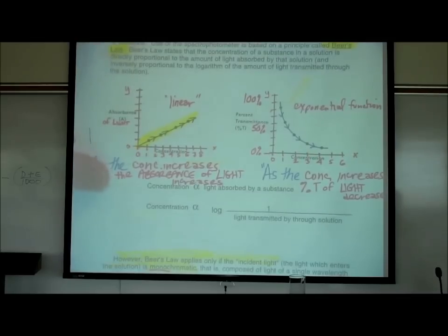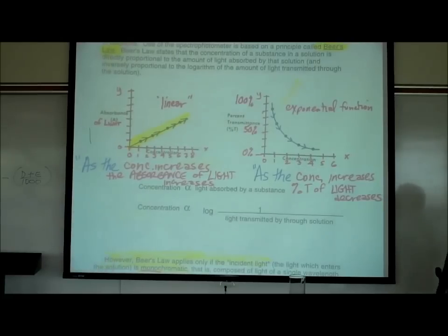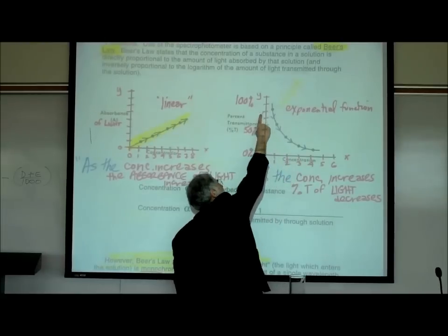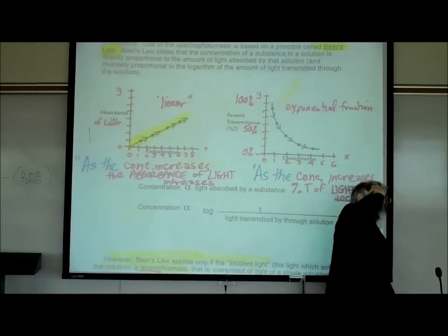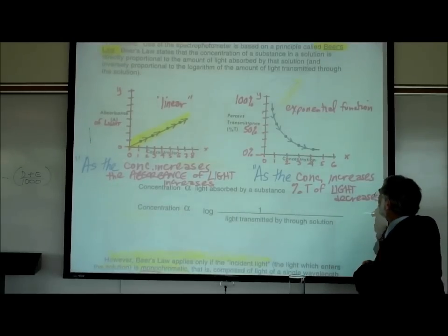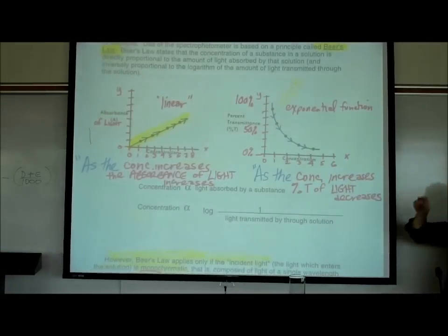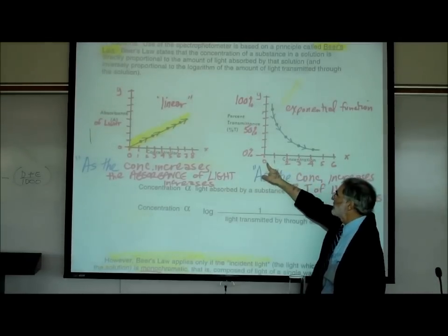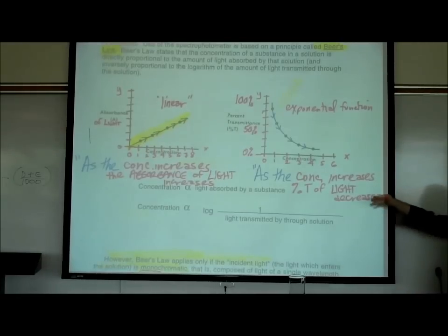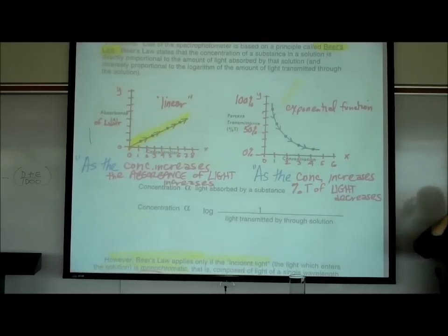We have already told you by the time you're done with this physiology class, you're going to be very good at reading graphs. All right, let's start with this graph. This graph, we always begin first by looking at what's plotted on the x and y axes. So what's plotted on the x-axis is the concentration of the chemical in the solution. Now, I made up numbers 0, 1, 2, 3, 4, 5, 6. That's simply showing increasing concentration of a chemical in a solution.